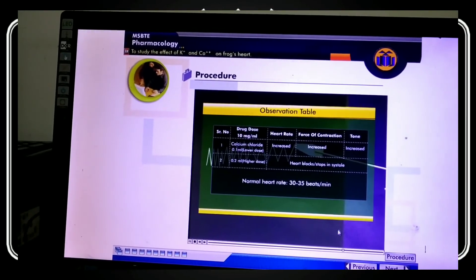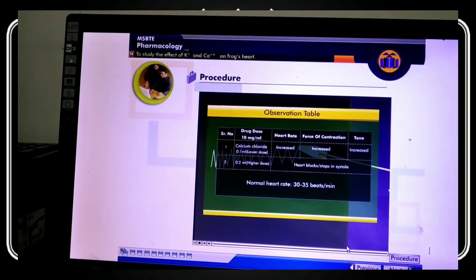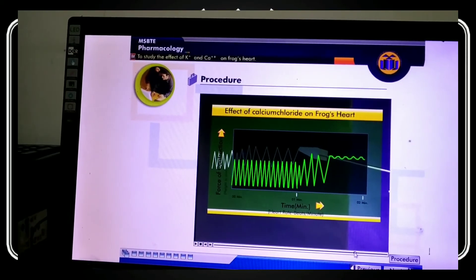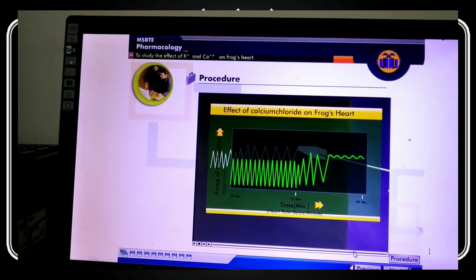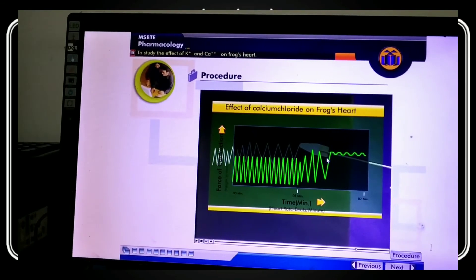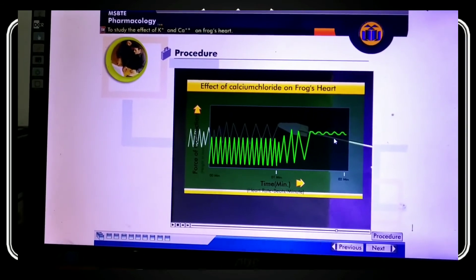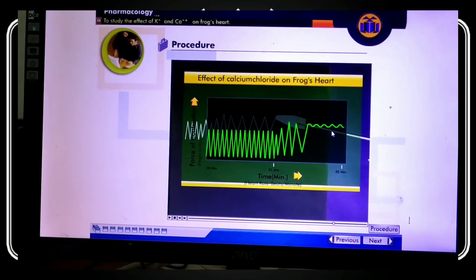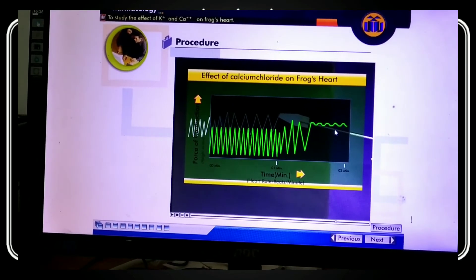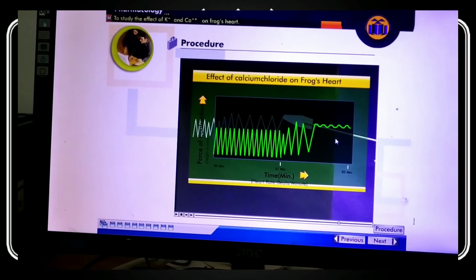The heart stops in systole after calcium chloride administration. You can see that the heart stops during systole because it is unable to relax the heart muscle due to the excitatory effect of excess calcium chloride.